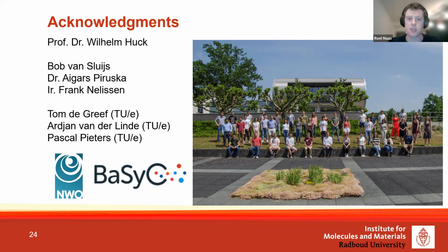And for the maturation time, it doesn't really matter that much because we measure that directly. So we have a fixed value for that. So having a shorter or longer maturation time at the end doesn't really matter, I think, for the amount of information you get out of the system, because that's a known parameter. So you exactly know how long it would take for maturation.